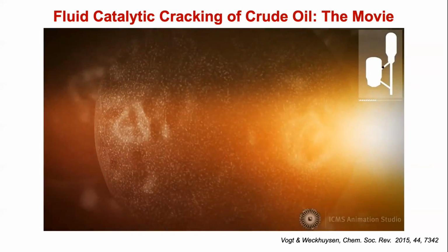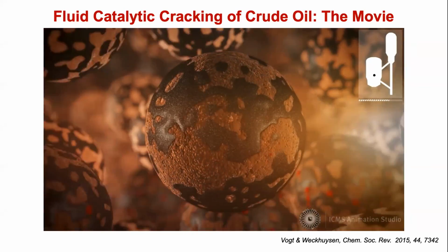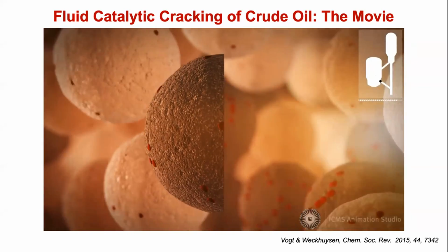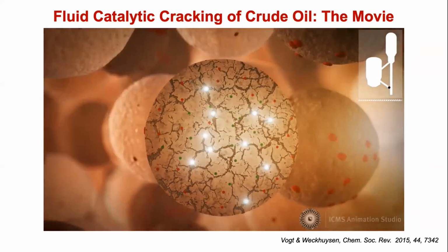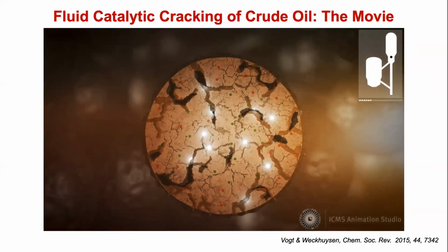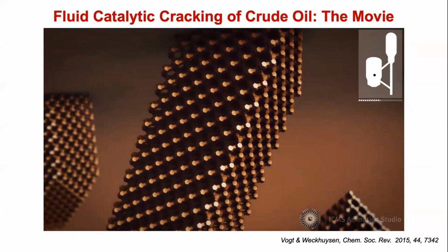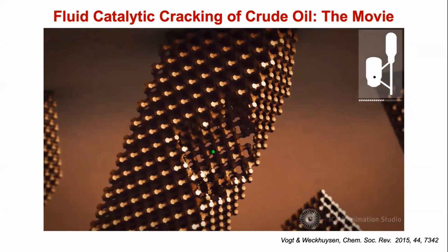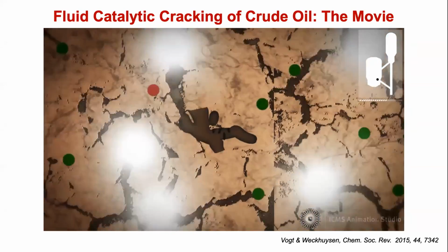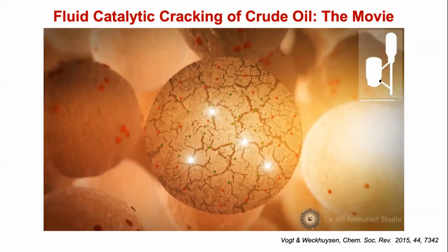And now we go to the regenerator. The catalyst is blackish, brownish, and you have to burn off the coke. Then you see these measles in red on the catalyst particle. They actually penetrate into the sphere, and what you have are the metal poisons. They kill the zeolite by destroying the aluminum framework of the zeolite, and after a while you don't have acid sites. So this is the movie.